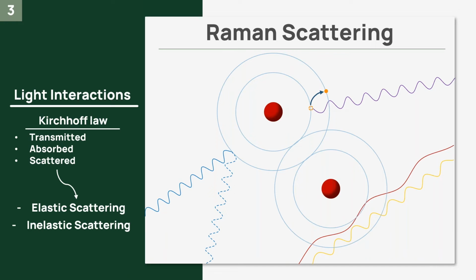And then finally, we have, of course, scattering, which also includes reflection, which is very typical. Everybody's familiar with that. That's where the photon of light comes in and changes direction somehow. If it's reflected, that direction change is dictated by the laws of reflection: basically, the angle of incidence is equal to the angle of exit. But it can also change direction into some other direction than that, where it's just generalized as some other scattering event. There are many different types, but they basically divide into two main portions: elastic scattering, where the energy of the photon is conserved, and inelastic scattering, where the energy of the photon is somehow changed.